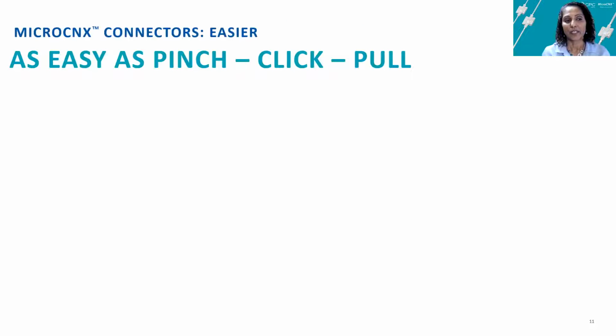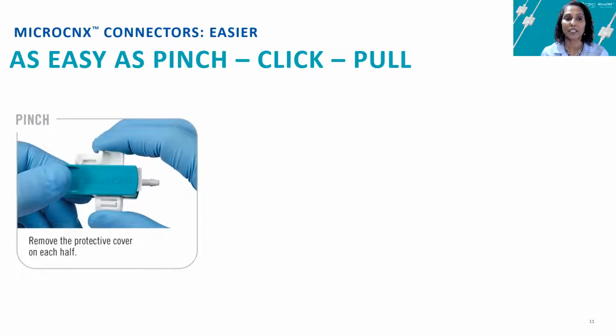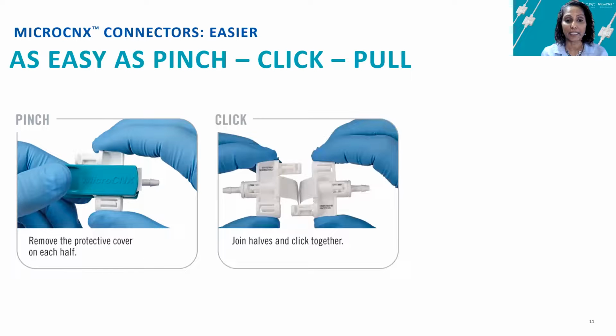And when I keep saying the connectors are easy to use, it's a matter of just pinch, click, pull. These are the terminologies that you're going to see from CPC or any of the application engineers that you're working with as they're training you. And what does that mean? When you pinch, you're pinching the protective cover. It's a teal cover on the connector that you'll be pinching off from the connector, and that exposes the connector and will allow you to actually have the connector.